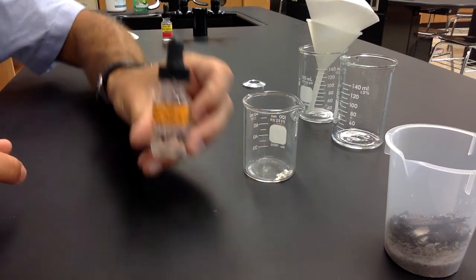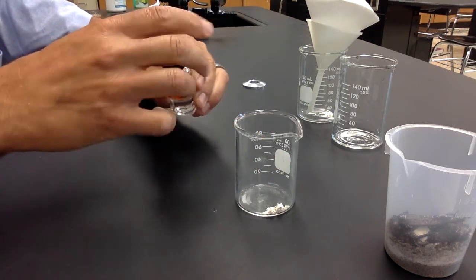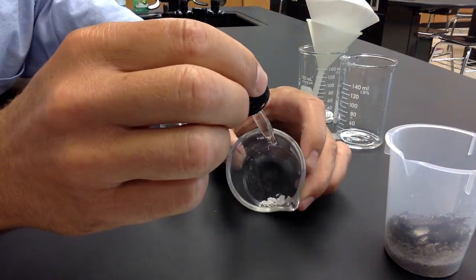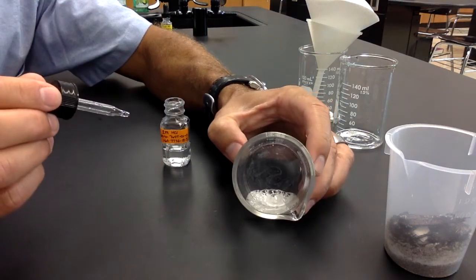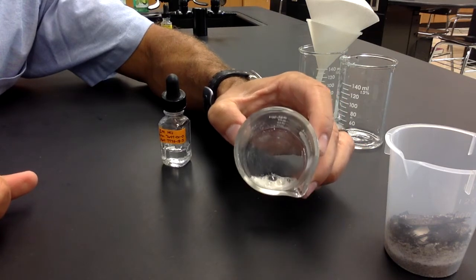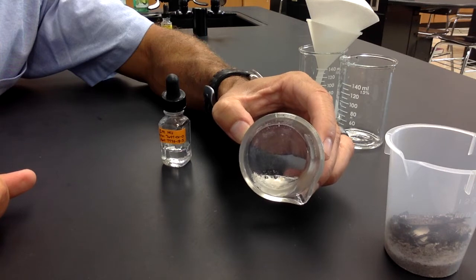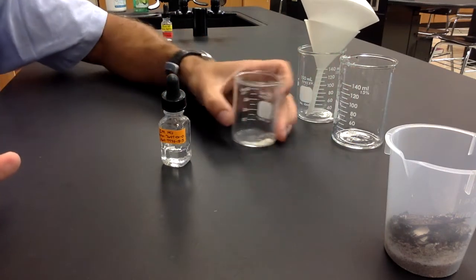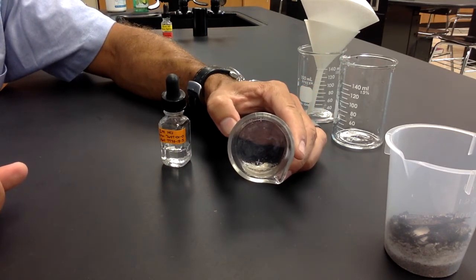The 0.1 is not going to react as quickly, and you will be able to see that when you add the HCl to the seashells, they will react. You will not be able to preserve the seashells, so the seashells will dissolve into the hydrochloric acid, but you will be left with the sand at the end. So remember these two methods of filtering and reacting with hydrochloric acid in order to eventually isolate the sand.